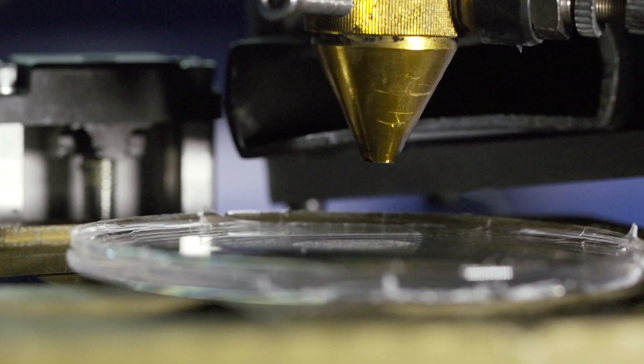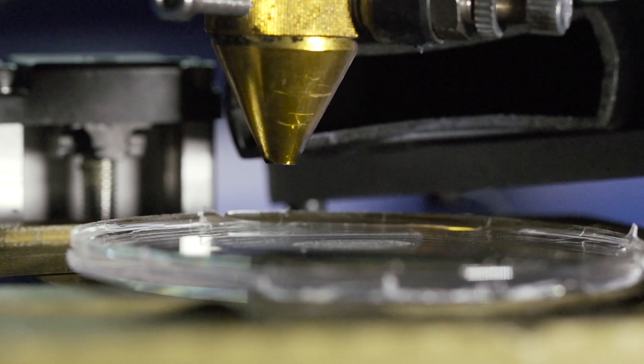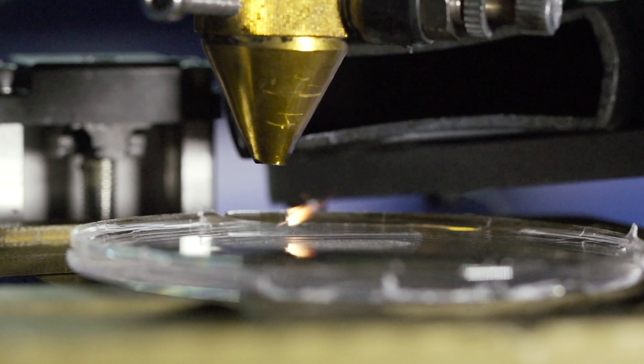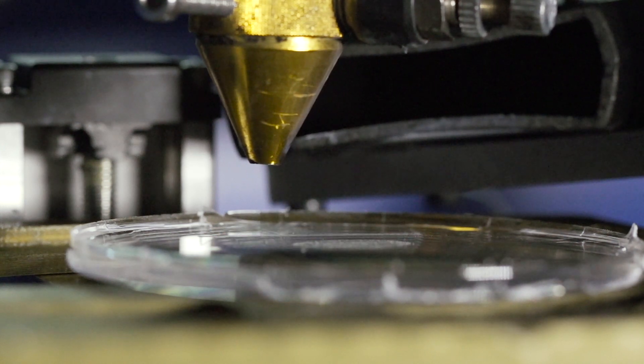We are mass producing at a way faster rate than anyone else — we're producing 50,000 microwells per hour. With normal technology, it's called the hanging drop method, where most labs pipette each individual aggregate on top of a lid, which is an insane amount of work.